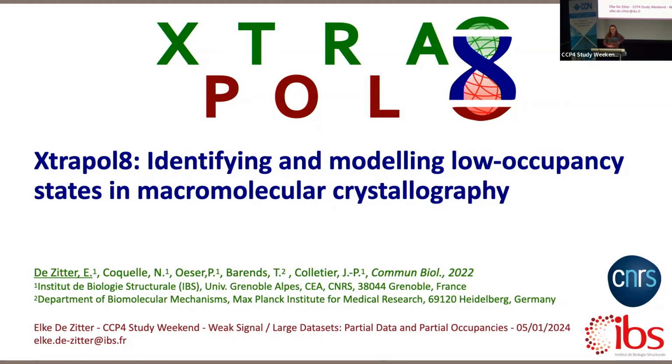Good morning. So I am Elke De Zitter from the IBS in Grenoble, and I will tell you about Xtrapol8, which is a tool to identify and model low-occupancy states in macromolecular crystallography.